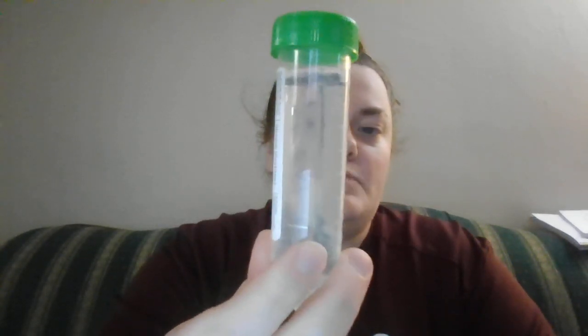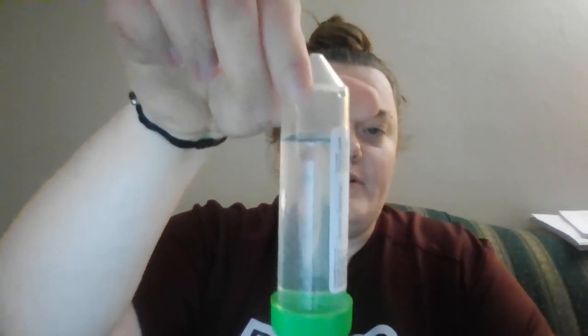The purity of the compound has to do with the impurities in the mixture. If there are a lot of impurities, it will interrupt the changing of the light and block some of it naturally. So we have some substances and compounds that, when mixed together, have very little impurities, and you can see that they're basically clear. And light passes through this very easily. Then you have some compounds that have a lot of impurities in them, and you can see that when they're moving around.